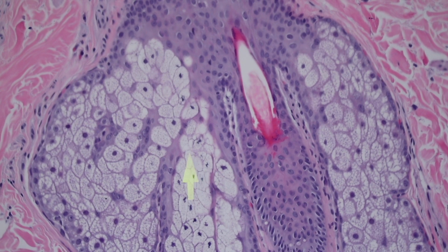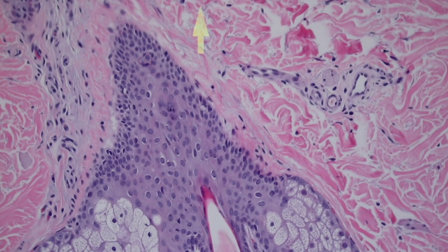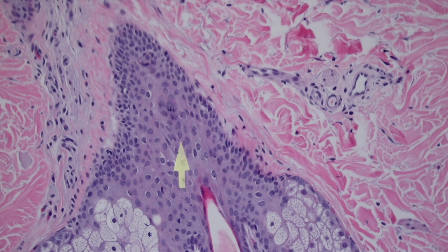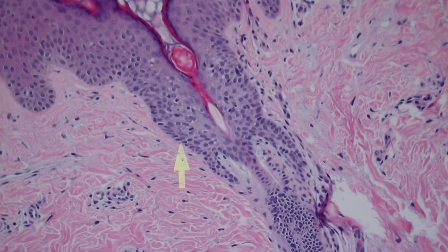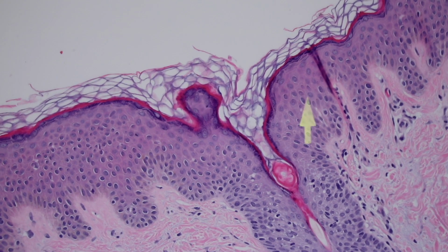And you can see the sebaceous glands, one here and one here. Their job is to drain straight into and kind of coat the outside of the hair shaft. And so the sebaceous secretion will drain into the follicle and come out of the top of the follicle onto the skin surface right around where the hair shaft exits. And see, here's the opening of the follicle. So we'll look again at follicles in a minute.